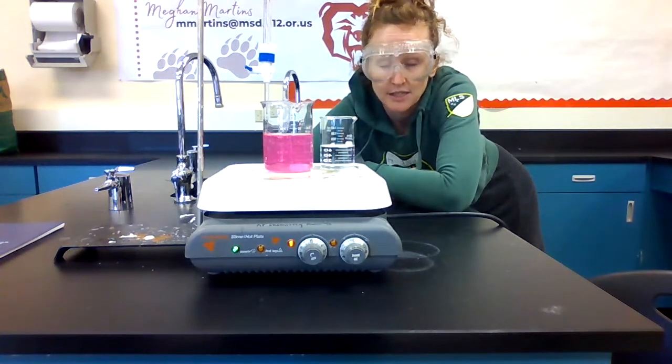So how much did I add? This is why burettes can be tricky to read, because the number that you read them at is not necessarily the amount that you have added. So if I started at 2.5 and I added to 50, it's actually the difference that I added. So I added 47 milliliters.